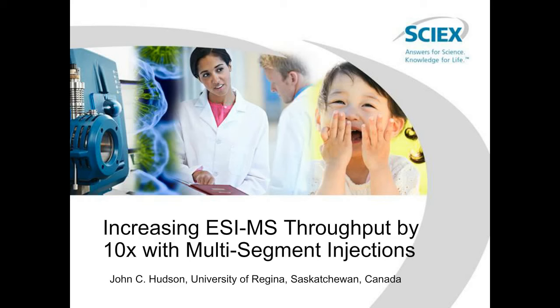Greetings, everyone, and thank you very much for joining this webinar this morning. This webinar focuses on increasing throughput in electrospray ionization mass spec using a technique called multi-segment injection. Now, I've been working in separation science for quite a long time, and I got interested in capillary electrophoresis around 1993 while working as a toxicologist. As a toxicologist, I was analyzing drugs and poisons for the Royal Canadian Mounted Police forensic system. And since that time, I've spent most of my time on the integration of capillary electrophoresis with mass spectrometry.